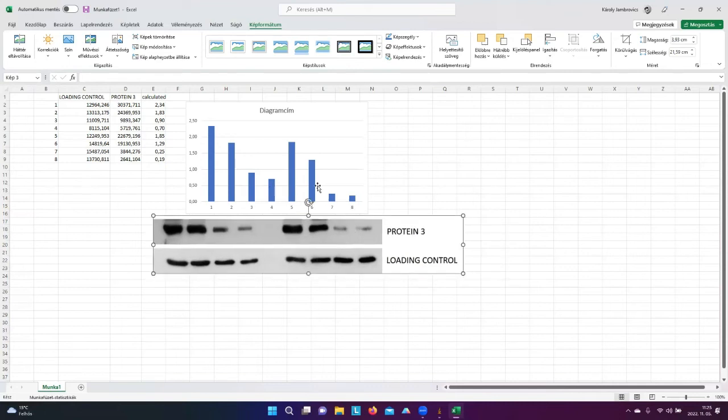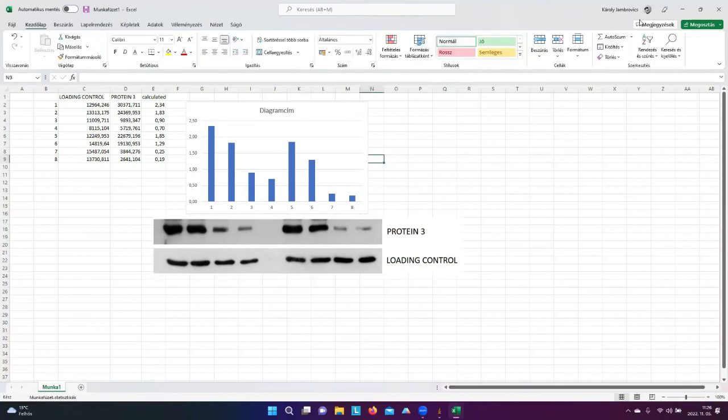The same thing happens here. It is high and this is also high, but compared to these two, it was a really, really low expression. So I would say that that's a good type of analysis that we have done. But there are some cases when you make a mistake. I'm going to show you how it works.